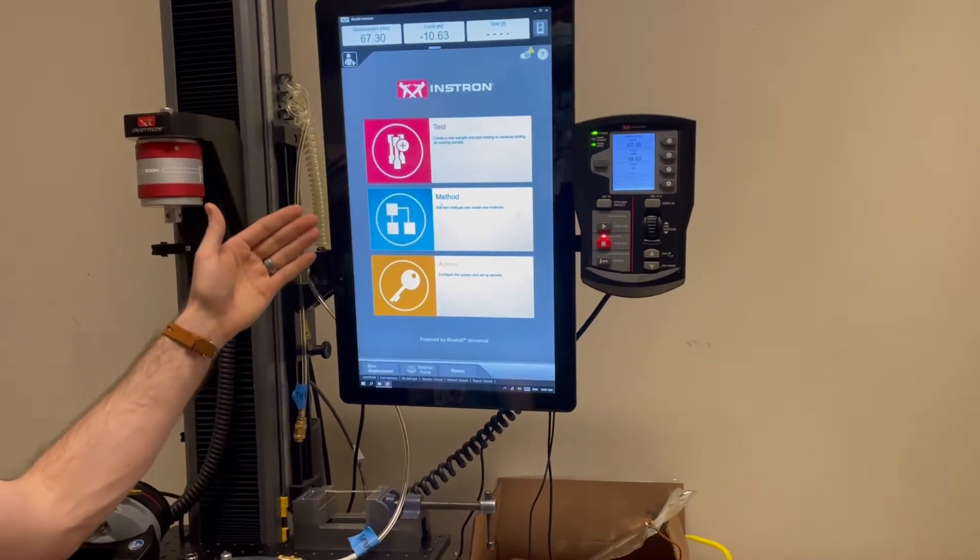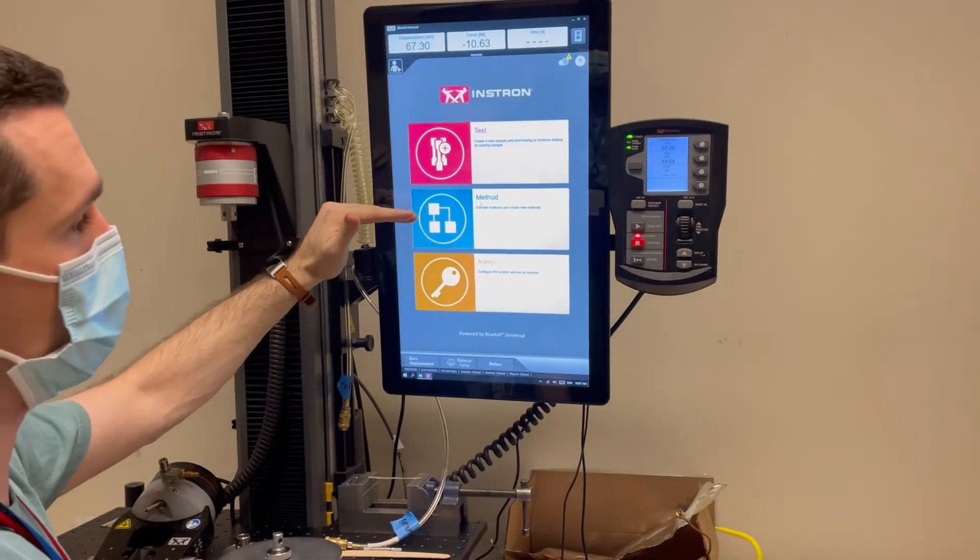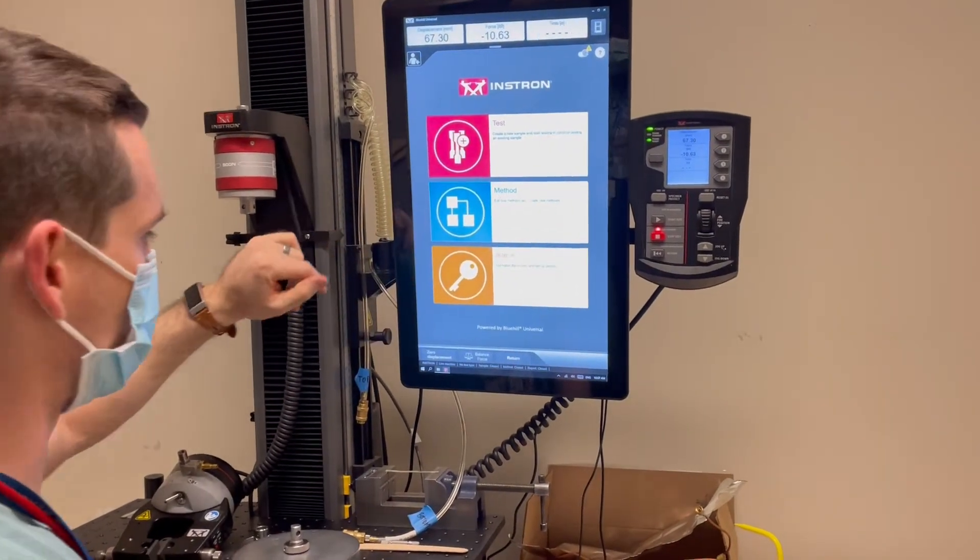You'll then see this screen with options to start a test, continue an existing test, or make a new test method. Don't worry about the admin stuff.